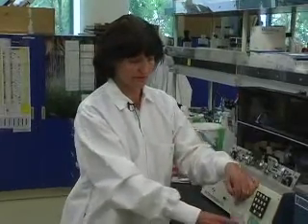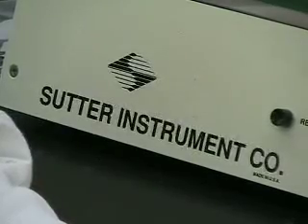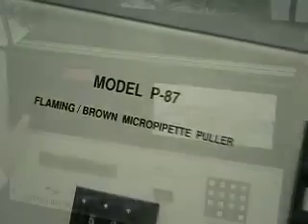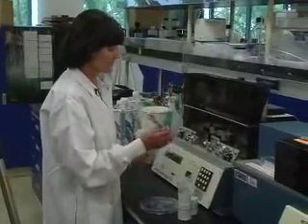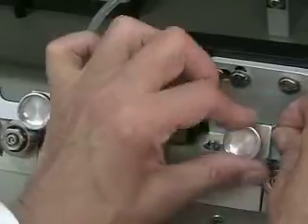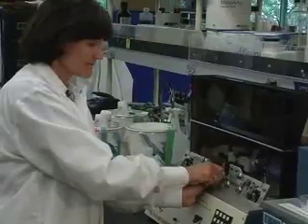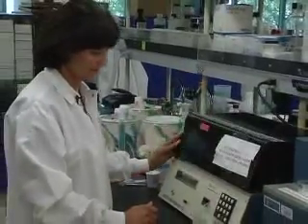I am making needles for microinjection using glass needles. We are using the puller from Shuttle Instrument Corporation, model P87. I place the glass needle into the ring and fix it from both sides, close the lid, and push and pull. The needle is ready.